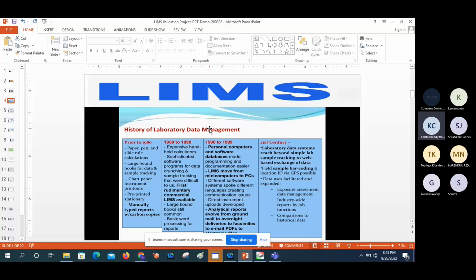At that time they started some core, basic type of LIMS. After that, large bound books were still common, so it continued the same from 1980 onward, with basic word processing for reports. So they were preparing some of the reports. This is general basic information I'm presenting now.